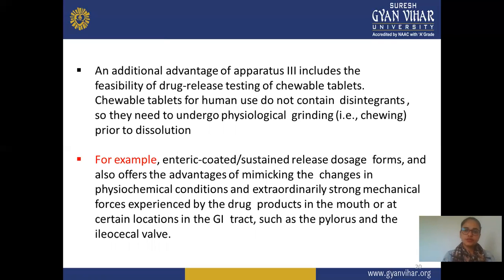And for enteric-coated or sustained release forms, it also has the advantage of mimicking the change in physical and chemical conditions, and the extraordinary strong mechanical forces experienced by the drug product in the mouth or at certain locations in the GI tract, such as the pylorus and ileocecal valve. Means this type is mainly used for both enteric-coated and sustained release formulations, because the tablet gets released in the intestine or GI tract, and it shows the advantage of mimicking the changes of physiological condition and shows good mechanical forces on the product. So this is the advantage of this type 3 apparatus.